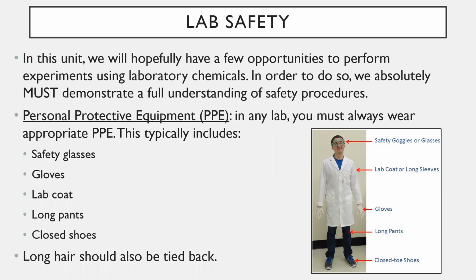you're going to have to bring on your own, and closed shoes, which you would also have to bring on your own. So in other words, if we are ever having a lab, and again, I'll tell you several days in advance that, yep, we have a lab coming up on a certain day, you will be expected to come dressed appropriately. You will have to have long pants and closed shoes. So in other words, no shorts and no sandals or anything like that.